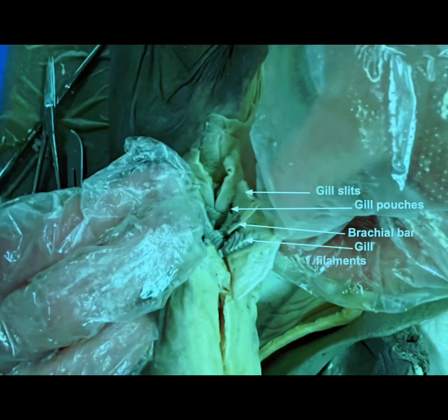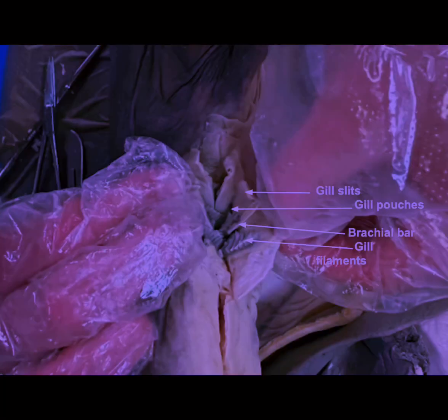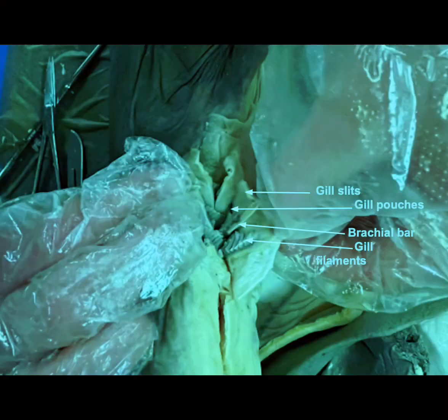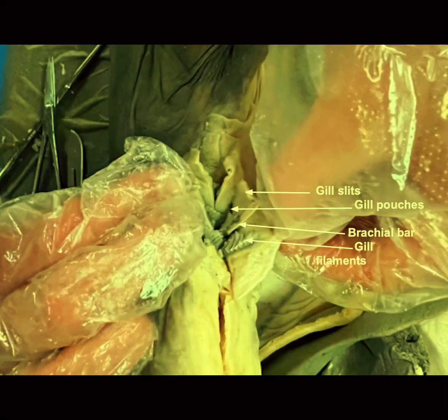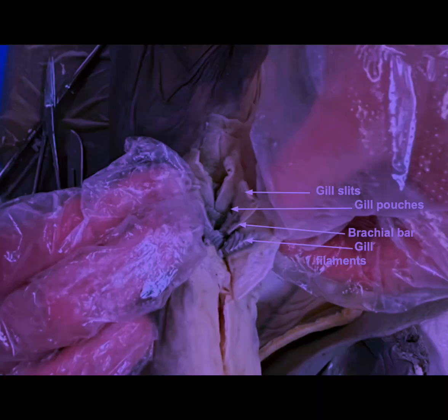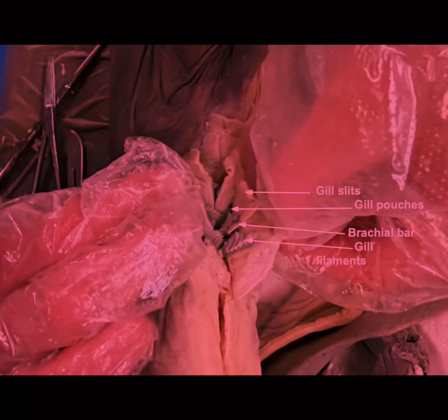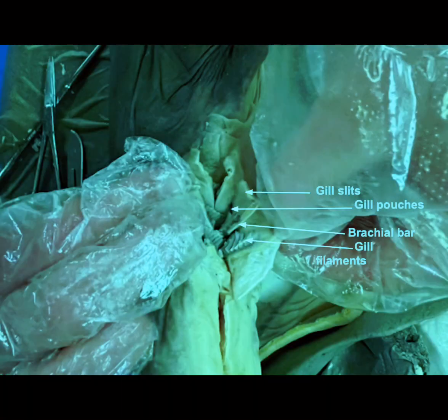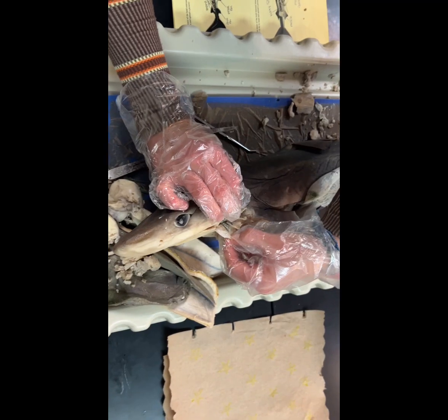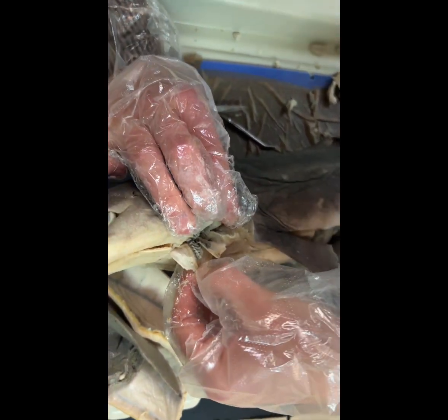Sharks have gill slits, 5 of them in fact, and they are located on the sides behind the mouth. Water is taken in through the mouth and spiracles, then leaves through the gill slits. They also contain gill pouches, cavities that lead to the outside through the gill slits. Then there are the gill rakers, small finger-like structures that act as a strainer to stop food particles from leaving the pharynx through the gill slits. Lastly are the branchial bars, which are simply partitions in between the gill pouches. In here you can see that each gill is in its own individual pouch.